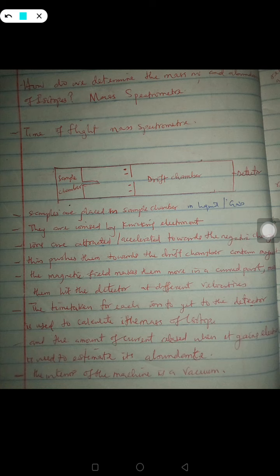Now immediately it leaves the sample chamber, it will enter into this chamber. You could already see that this region is negatively charged. If you recall from the basic principles of physics and chemistry, unlike charges tend to attract each other, and like charges tend to repel each other. Because everything coming out from the sample chamber is positively charged, they will be equally attracted towards the negative chamber, the negative electrode or pole.